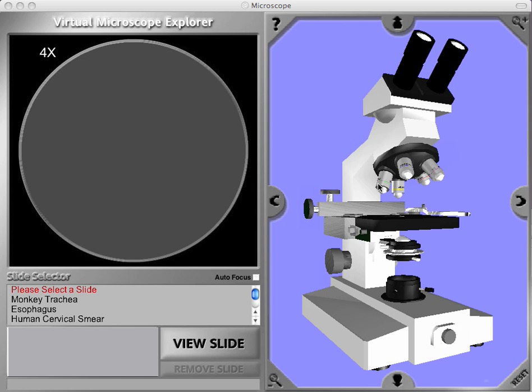I'd like to introduce you to the Virtual Microscope Explorer program. The program consists of a 3D interactive microscope that has the basic functions of a real microscope and reads images created with a $30,000 research microscope.